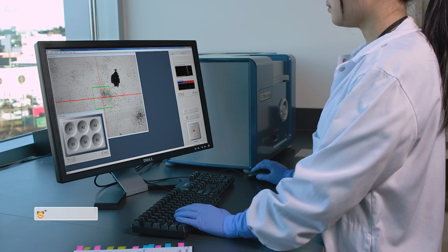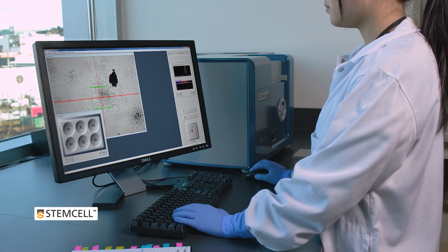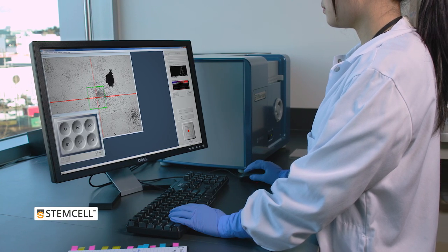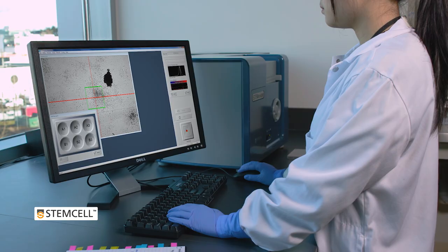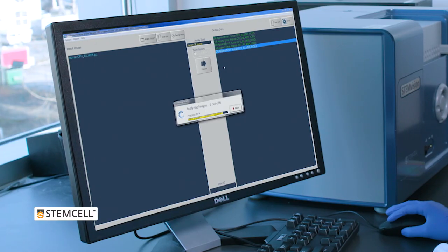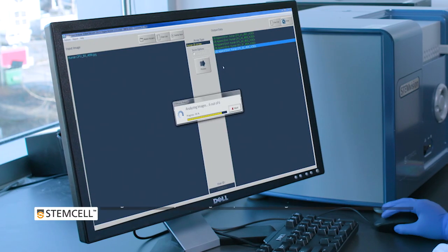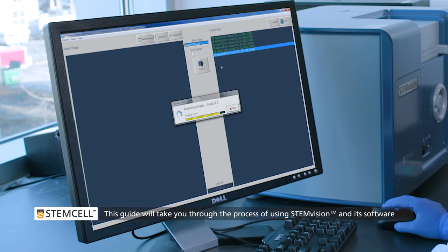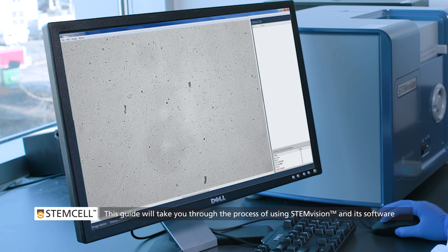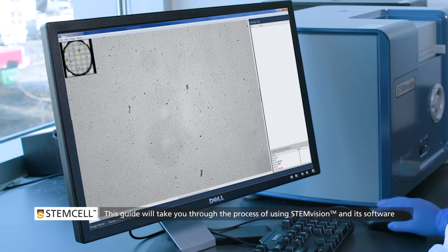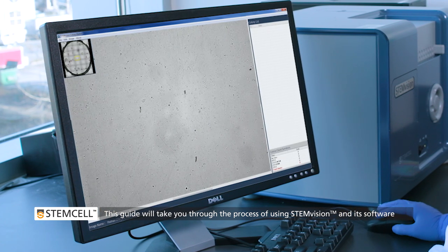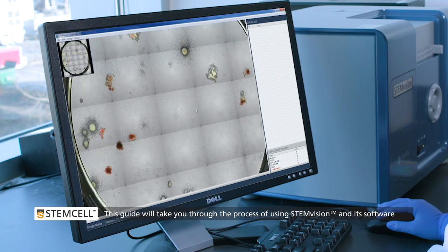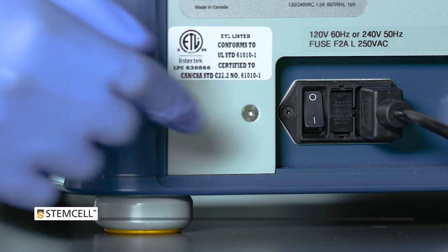StemVision is designed for the automated imaging and counting of human or mouse hematopoietic colony assays plated in Methocult medium. This step-by-step guide will take you through the process of using StemVision, from loading plates into the instrument to acquiring images and reviewing assay results.